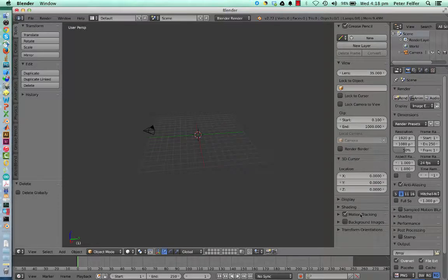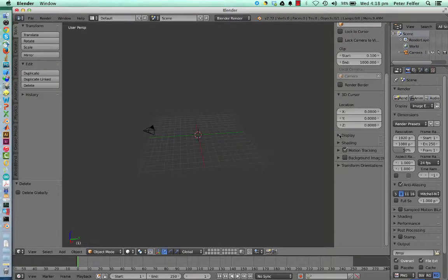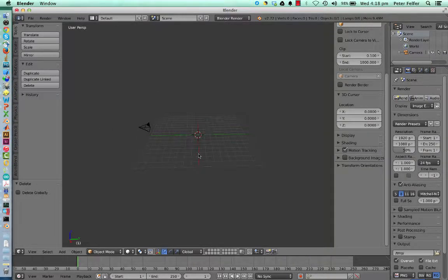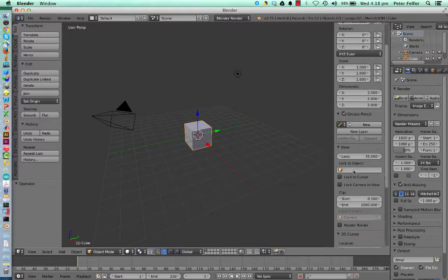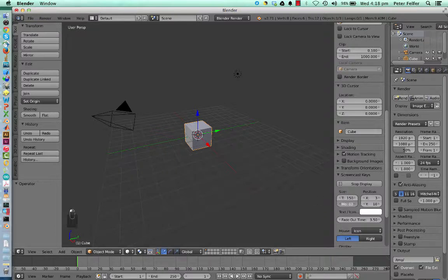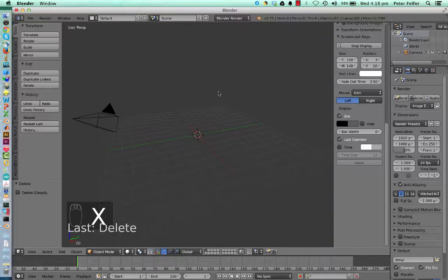Sorry, I'll switch on the screencast keys. Where do we have? Oh, it's 2.72, sorry, so there's no screencast keys. Let me fix that. You're always going to be using the latest version of Blender, but for my video tutorials I'm using a little bit of an older version, 2.71. The simple reason is that it's the last version that has the screencast keys, so that you will be able to see what I'm doing. You can see every key press here. Anyway, we'll select those again, delete them out, and load our data in.